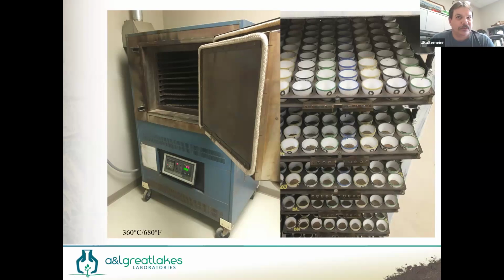I'm going to make this overly simplified because I don't want to get into all the details, but we're going to stabilize the weight. We're going to measure and weigh that. Then we're going to put it in that big blue oven. Surprisingly enough, they're Blue M ovens. And that oven's going to warm that sample up over a period of hours to 360 Celsius. And it's like burning leaves. It burns off the organic matter.